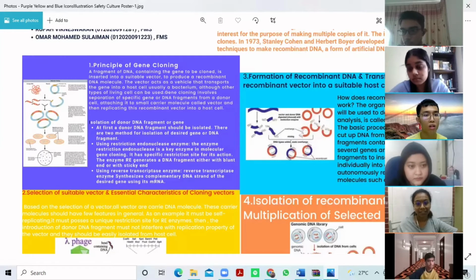This is a process very similar to transformation, which was described above. The only difference between the two is that non-bacterial does not use bacteria such as E. coli for the host. In microinjection, the DNA is injected directly into the nucleus of the cell being transformed. In biolistics, the host cells are bombarded with high-velocity microprojectiles, such as particles of gold or tungsten that have been used to coat the DNA.